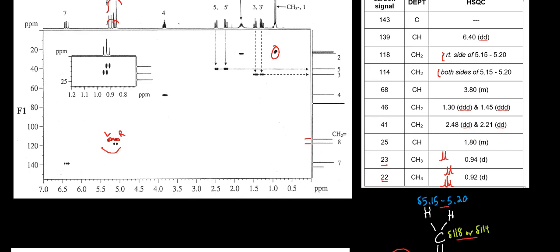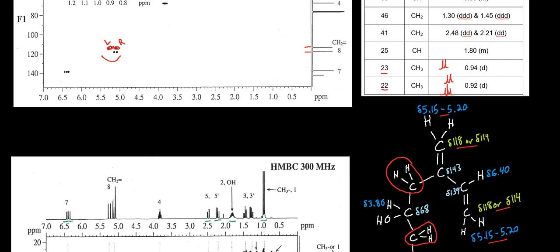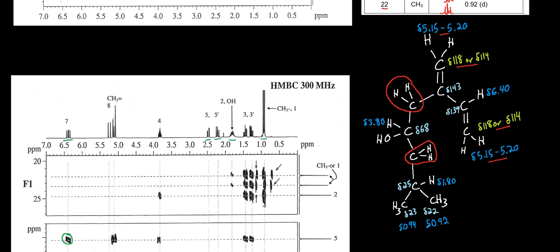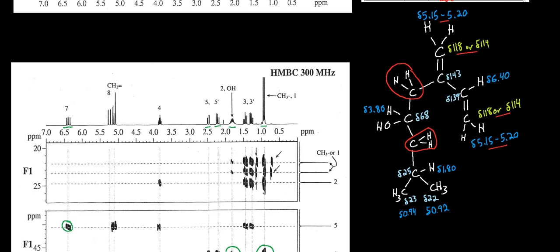We can make use of these assignments in HSQC, if you recall the Zoom session last night, in fact, where we can walk our way through the molecule finally using HMBC. So where we're at now after HSQC is here, and so the only ambiguity left is circled in red. We have these two protons and that carbon, these two protons and that carbon, and then which carbon is which as far as this carbon here, and this carbon here, we don't yet know.